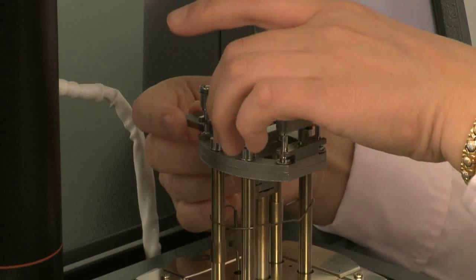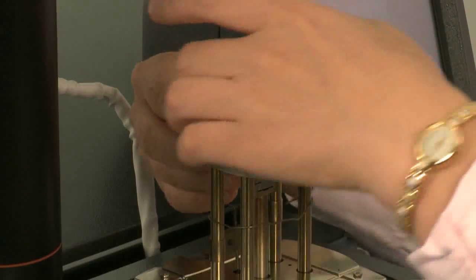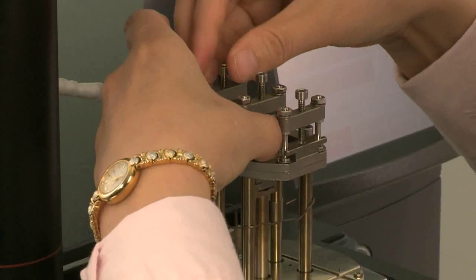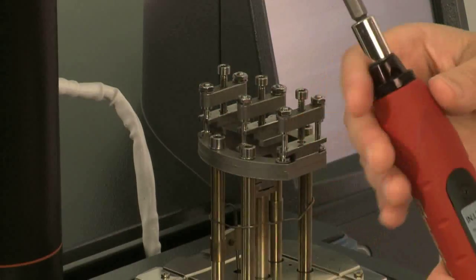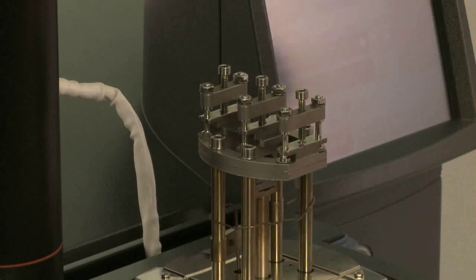Load the steel bar between the back of the stationary clamp and the movable clamp. Tighten the screws using the torque wrench with the torque range of 8 to 10 inch pounds.